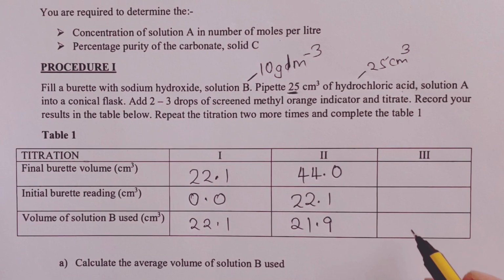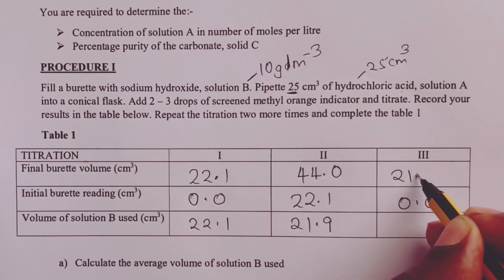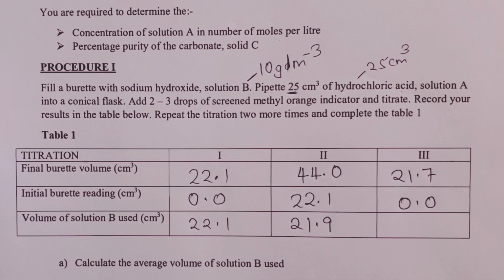For titration number 3, we were able to fill up our burette again to 0.0, and after we were through, we were able to get a volume of 21.7. That gives volume of B used as 21.7. We have always advised our students to have such kind of volumes.